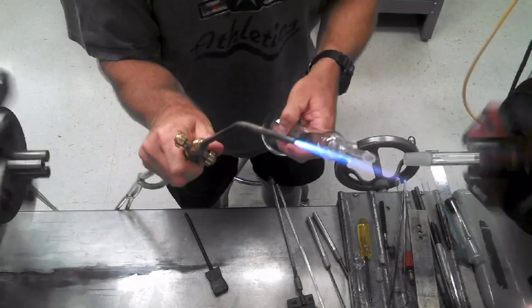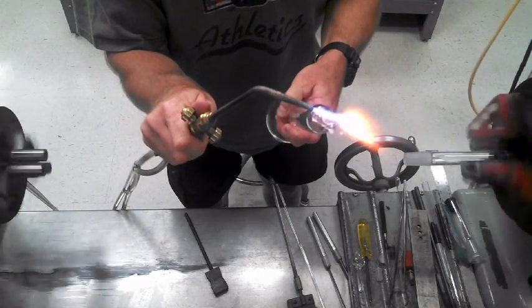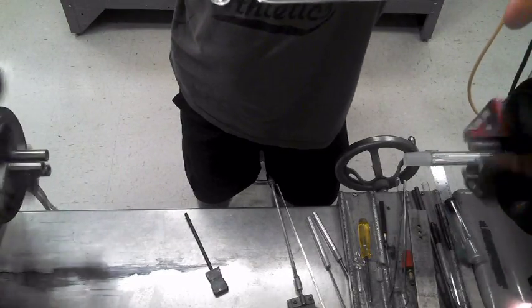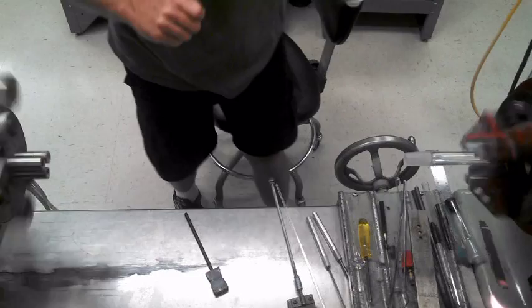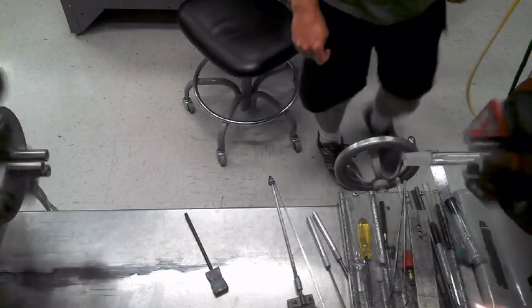Now check this out — this is fire polished now, completely done. The catch is I don't have to go get this wet now. This is going right in the oven. I hope you enjoyed.